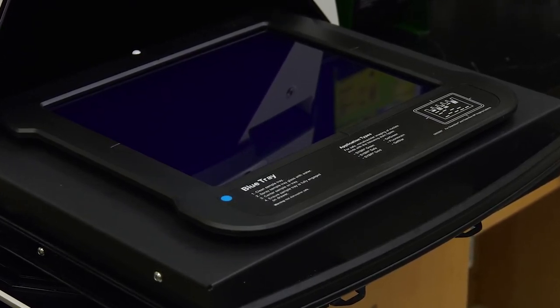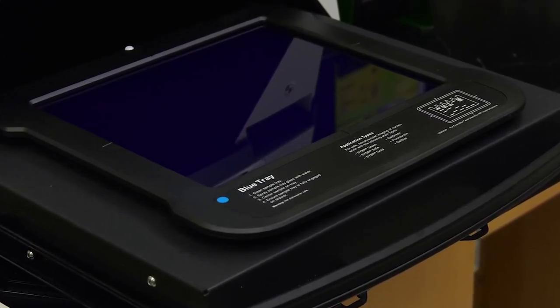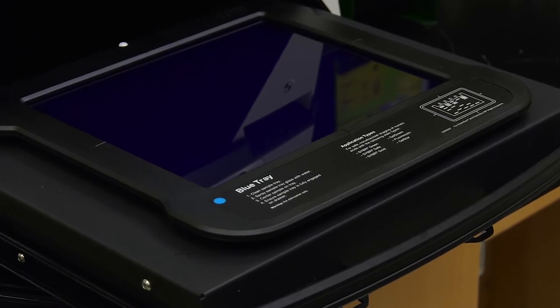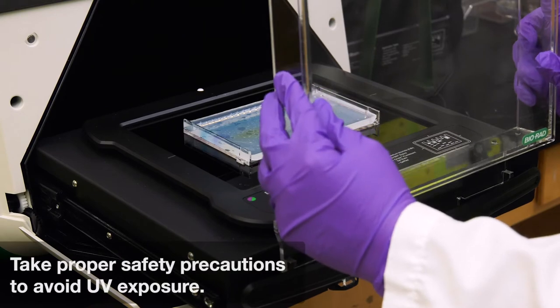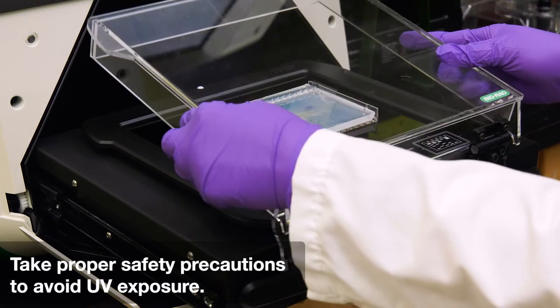The blue tray protects samples from UV damage. It also allows you to visualize DNA samples without a UV shield. The UV safety shield is necessary for band excision of UV-excited stains.